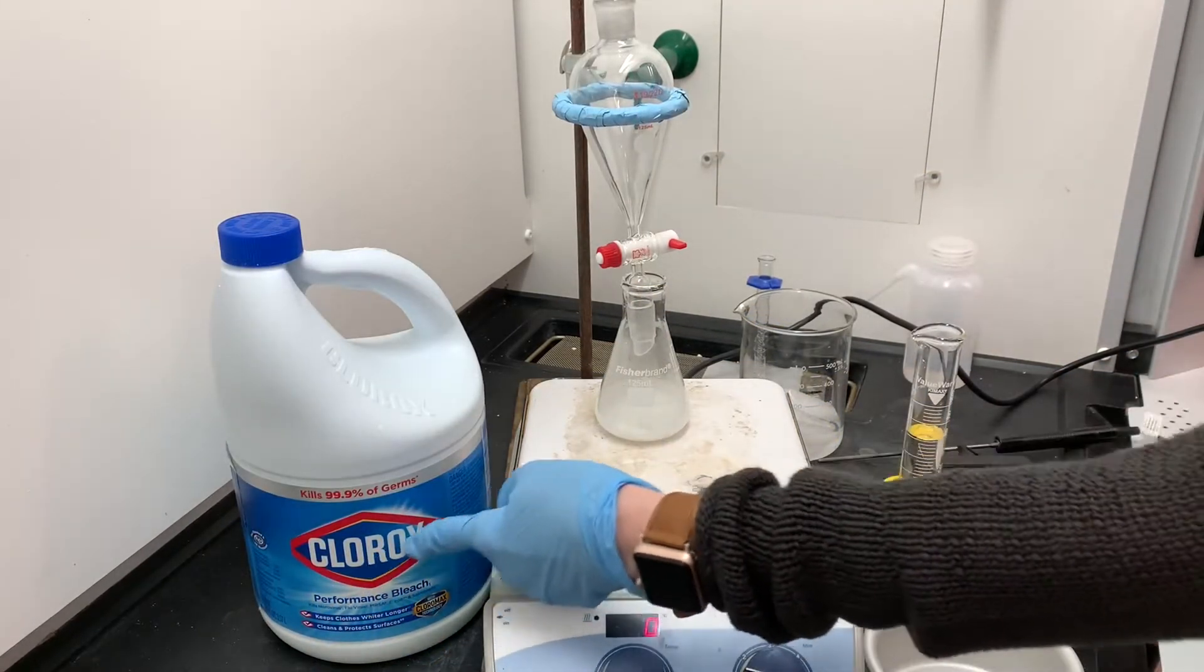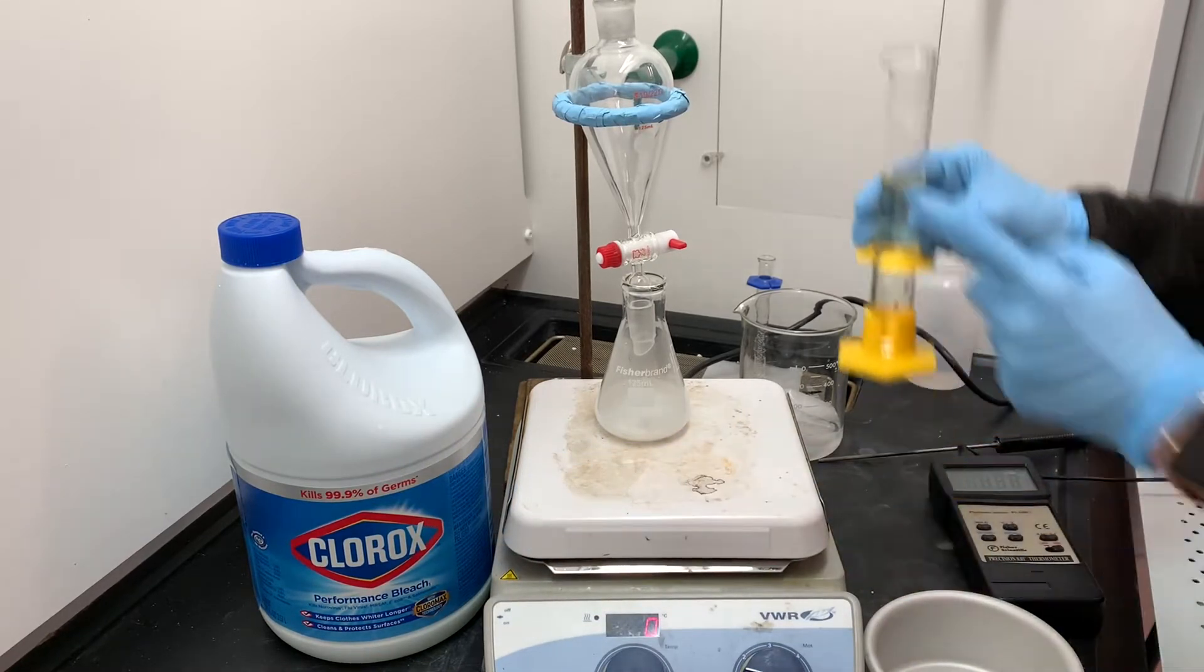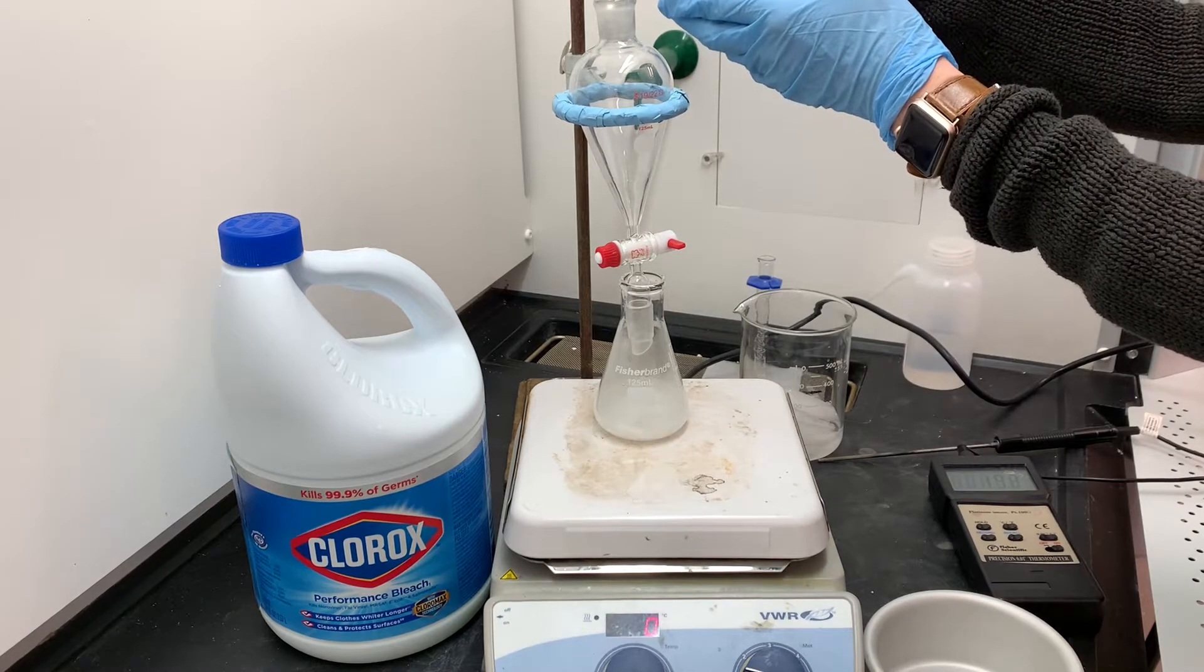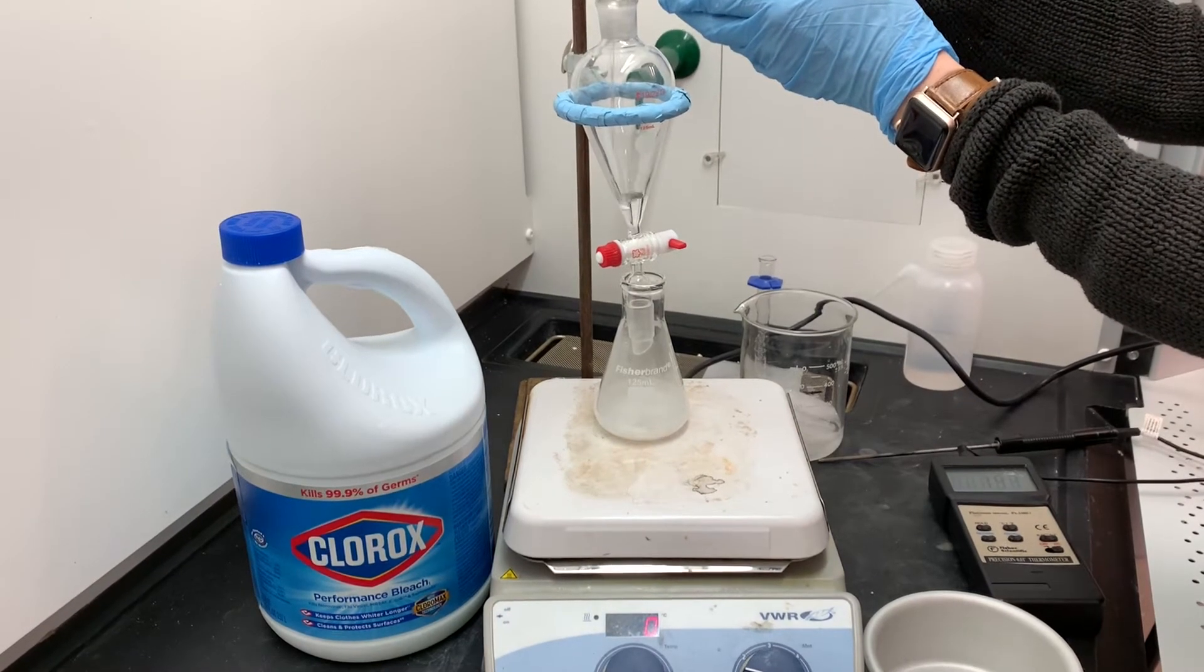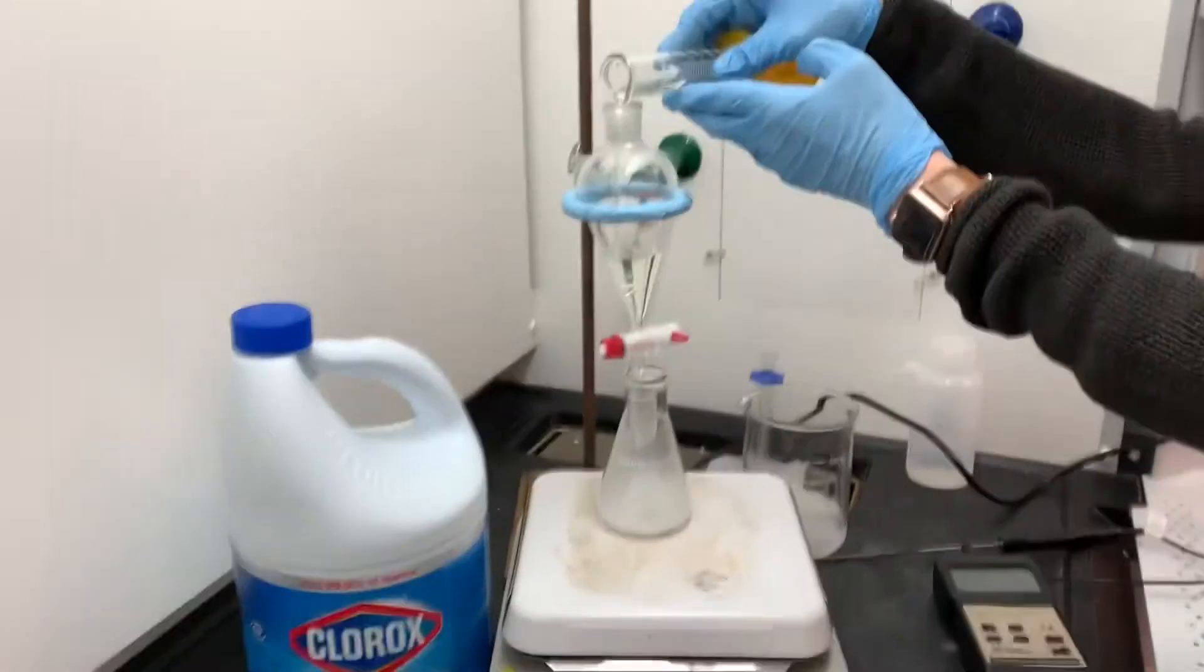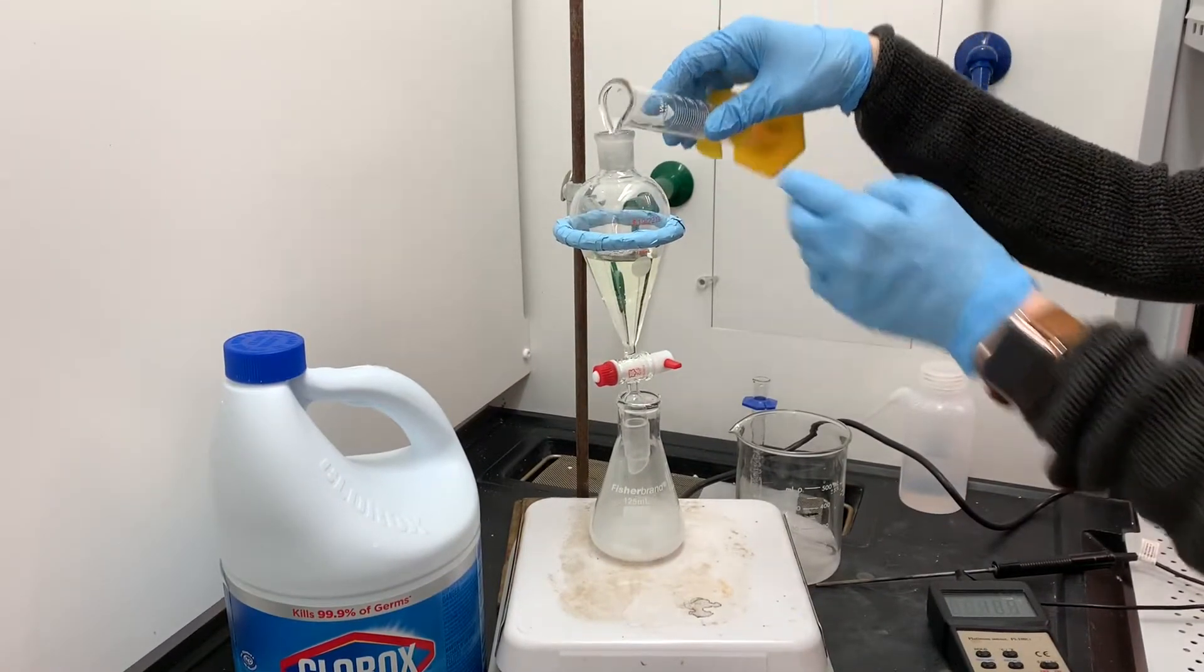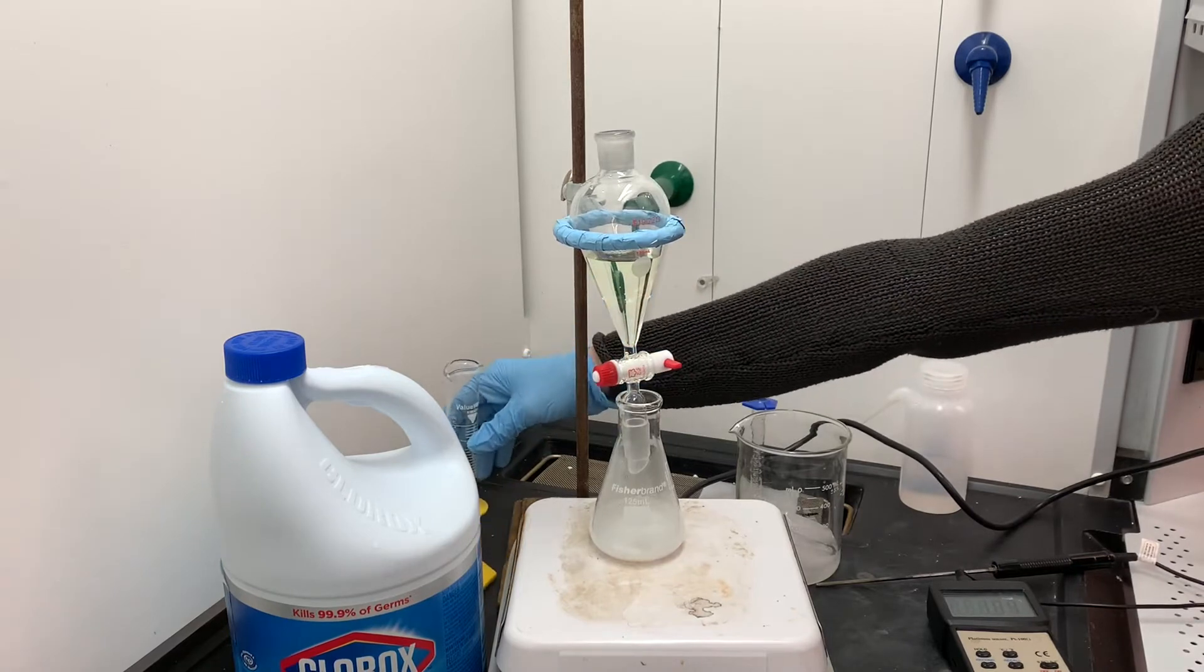We're now going to add some more bleach. I've got 40 milliliters measured out and I'm going to be using a separatory funnel to add the rest of this bleach. I want to add it slowly over a period of at least 10 minutes. This is a really exothermic reaction, so I don't want to add too much at once or it will get too hot.